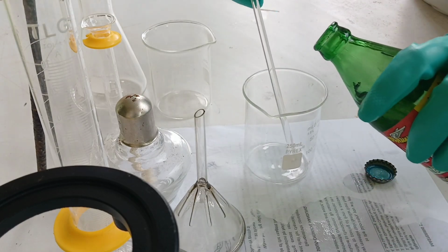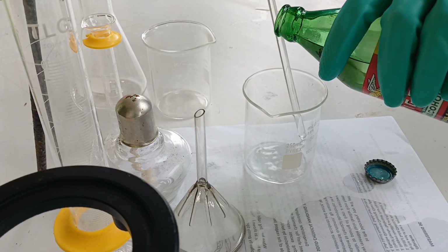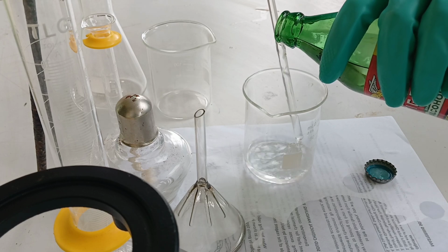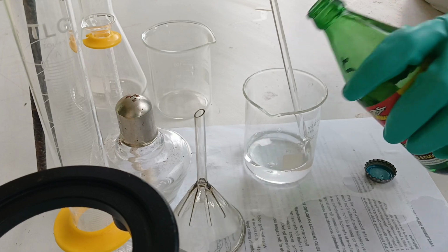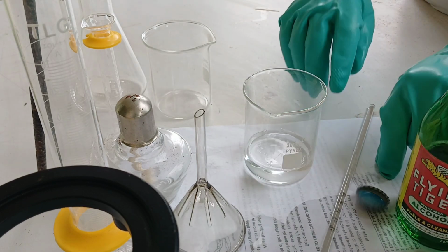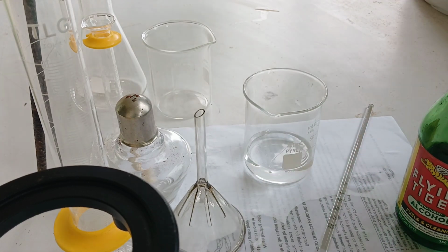With the use of the stirring rod as your pouring guide, transfer the liquid to the other container which is open mouth, just like that. That's the best technique to transfer, observe when you are inside the laboratory. Avoid spillage, number one objective. After which, you return the lid to your container.